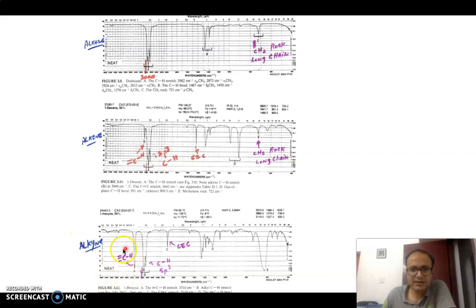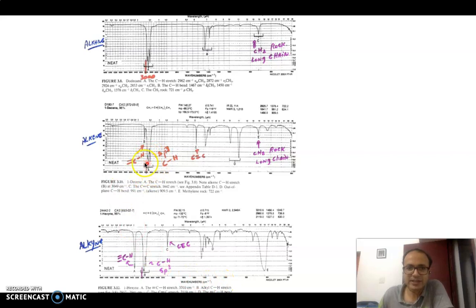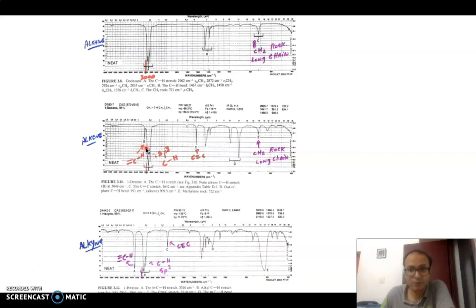When it comes to alkyne — in this case 1-hexyne — it contains a triply bonded CH bond as well as sp3 hybridized CH. So you see CH stretching vibrations on both sides of 3000 cm⁻¹. By looking at this region and the nature of the CH stretching vibrations, you can easily decide whether your compound is a purely alkane or contains alkene or alkyne or both.